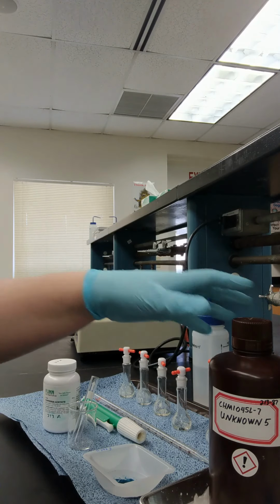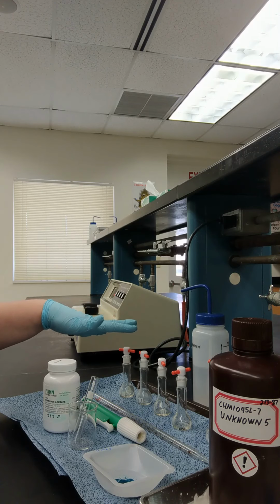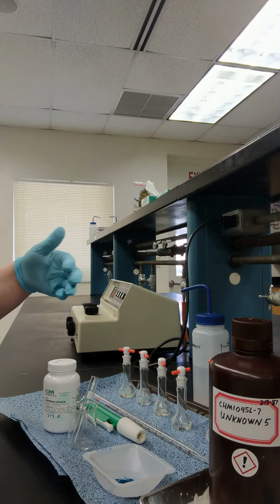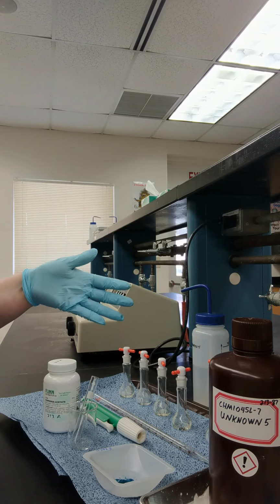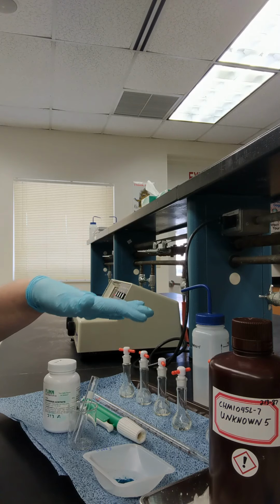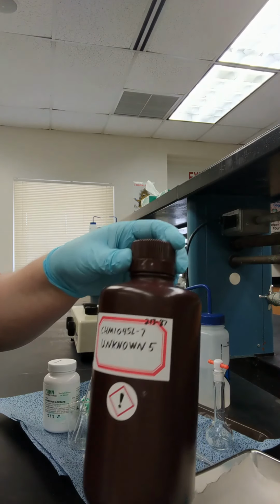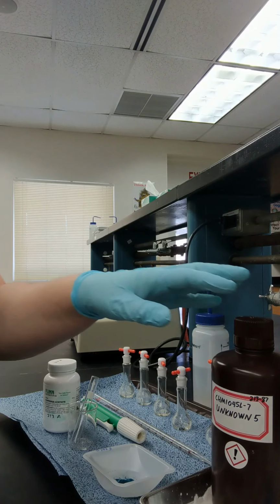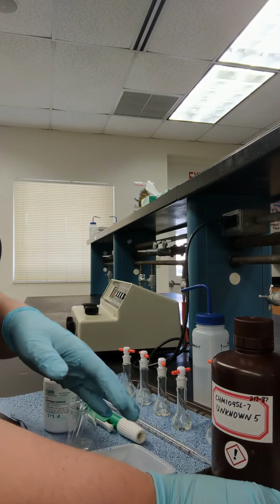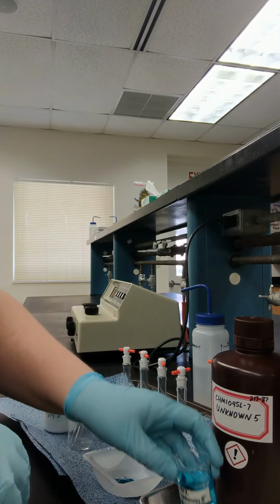So the point of the experiment is to use these standard solutions with known concentration, measure their absorbance, and prepare a graph, which is a calibration plot. From that calibration plot, using the absorbance from this solution, we can determine the concentration of the unknown sample that I have right here in a small beaker.